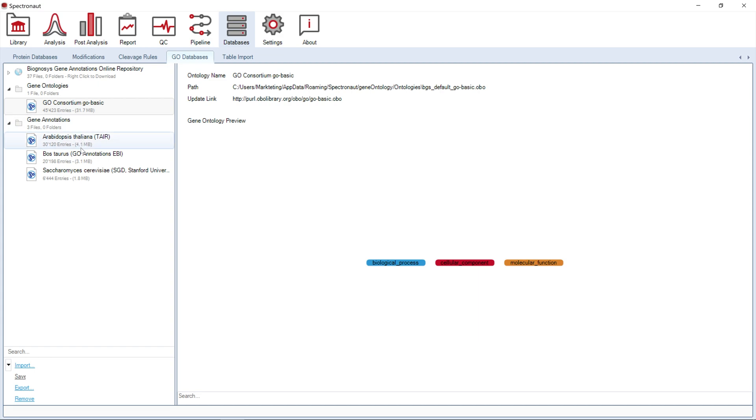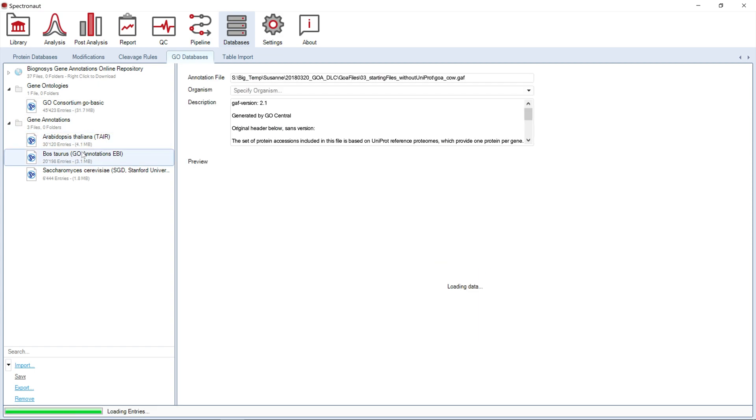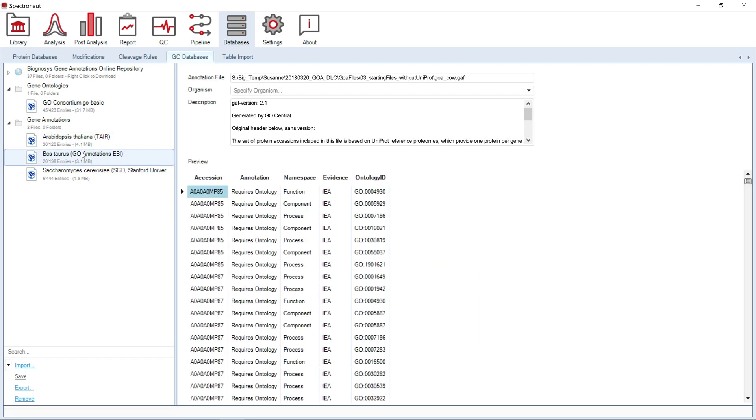The gene annotation file functions as a link between the protein identifier, UniProt accession number, and the geo tree. If you use gene annotations, Spectronaut will connect the protein entries of your analysis via the geo ID with the respective entries in the gene ontology to annotate your data further.